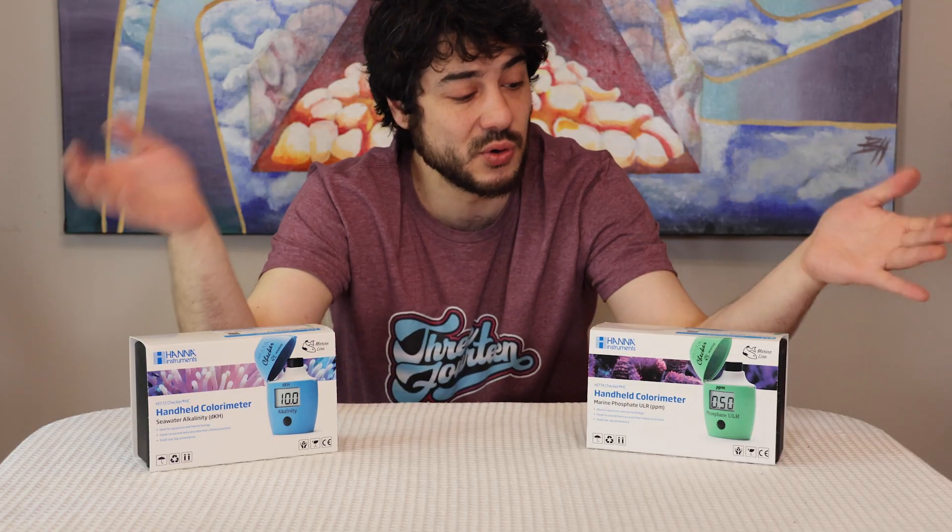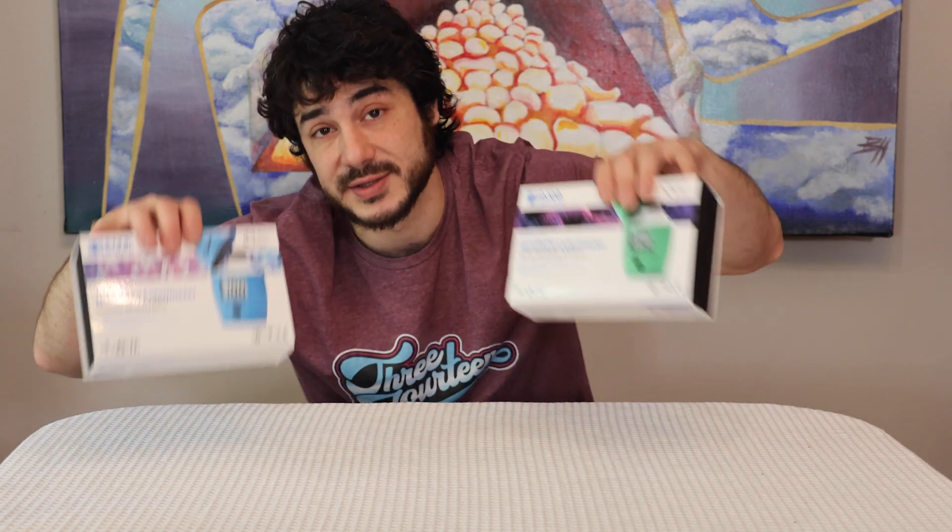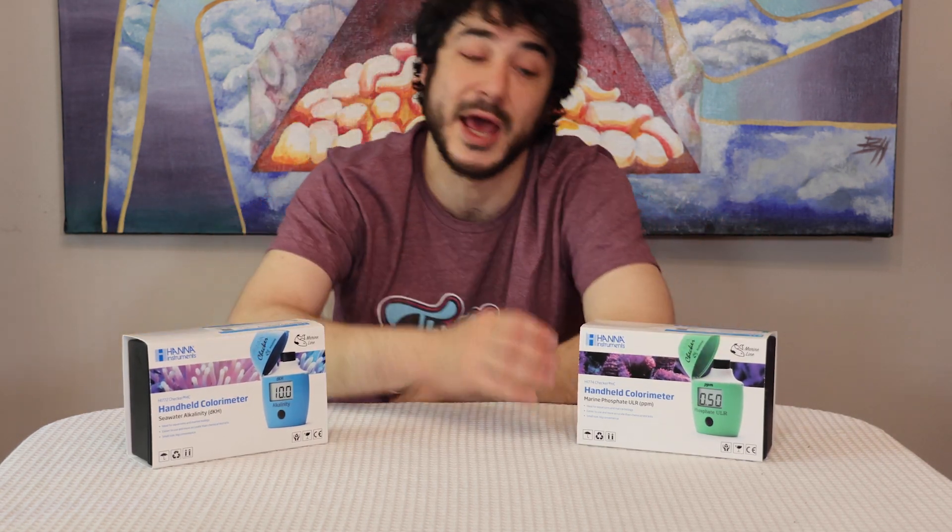Hey y'all. So I'm going to start a series where I go over some aquarium products that I would recommend for top quality aquarium husbandry. These are going to be some aquarium products that I've been using for a long time, as well as some new products that are on the market that I have tested and recommended.